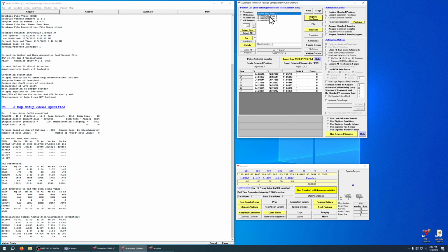So here we have a list that I digitized in the previous video, and you might run into a scenario where let's say you did an automatic digitize of a linear traverse, or you digitized your points using the digitize on an image function, and those points may not be quite perfect. They may be a little out of focus if your sample's not perfectly flat. You may have issues with maybe there was a crack or other phases in the middle of your transect and you're not sure if you hit them. So this is how we're going to check that.